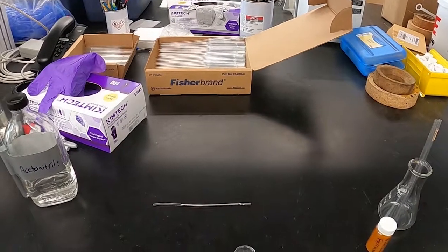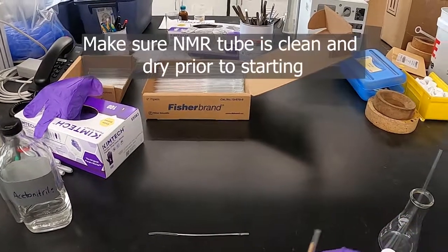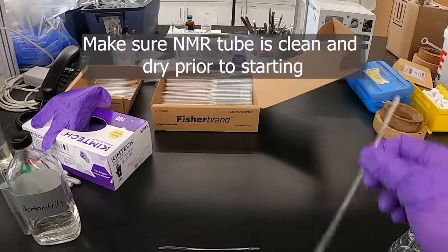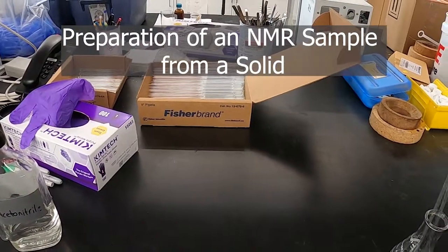I'm going to do a quick demonstration on how to put together an NMR sample using a solid that you're trying to analyze as well as a liquid. We've got here an NMR tube and I'm just going to use this ferrocene as a sample.